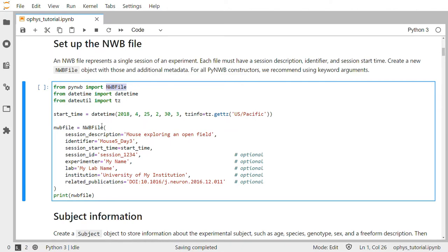Then we will call the NWB file constructor and pass it various keyword arguments such as the session description, identifier, session start time, session ID, experimenter name, lab name, institution name, and any publications related to this data. The first three arguments are required and the last five are optional. You can find additional optional arguments in the online documentation for PyNWB.